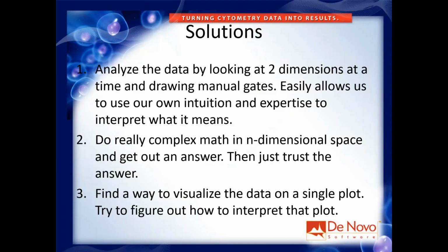And so people are trying to propose solutions for this problem, right? And the first solution is just draw more plots. I mean, that's the sort of naive thing to do. In fact, if I was trying to sell you my new algorithm, this is the one I'd immediately start making fun of and say how old school it is and how time consuming and how boring and how non-reproducible, and all those things that people say about these plots and these gates.